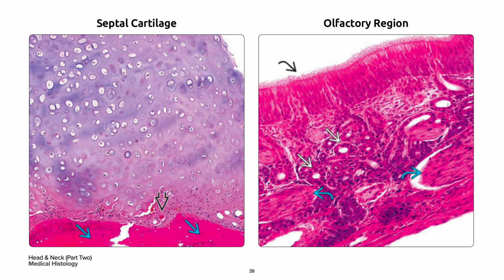On your right is the olfactory mucosa, which is a modified, ciliated, pseudostratified columnar mucosa in a curved black arrow with specialized intraepithelial olfactory nerve cells. These neurons fuse to form olfactory nerve bundles in a curved blue arrow in the lamina propria. Specialized olfactory glands or Bowman glands in a single white arrow are also present in the lamina propria and are unique to olfactory mucosa.